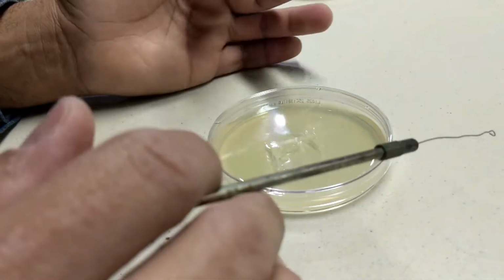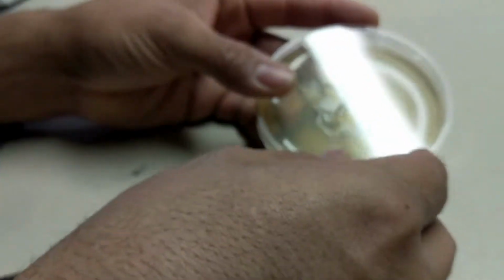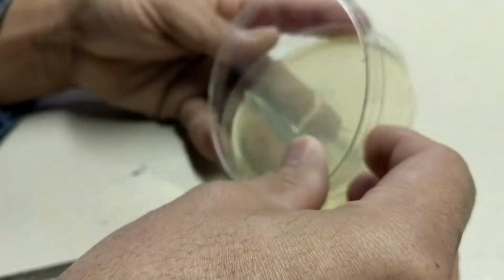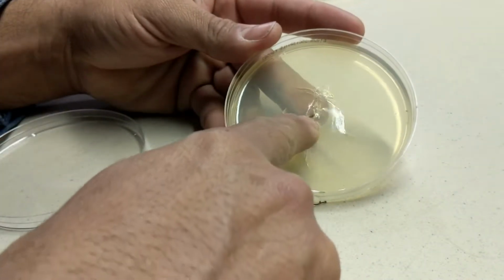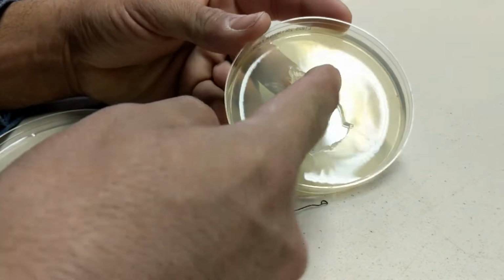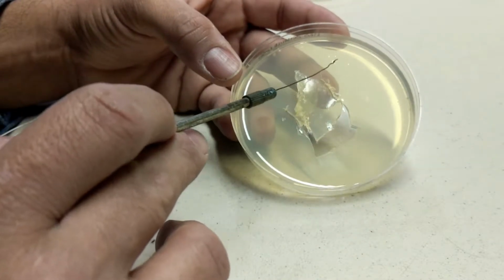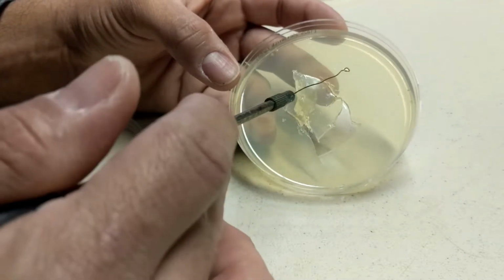So in this case, I want you to see the actual plate and how the agar looks as a close-up. You can see that the agar is breakable, very easy to break. Even when you're touching it with the inoculation loop, it's easy to break or to penetrate.